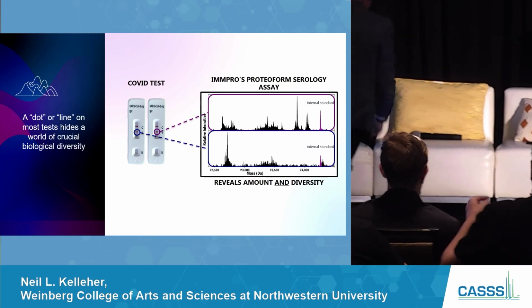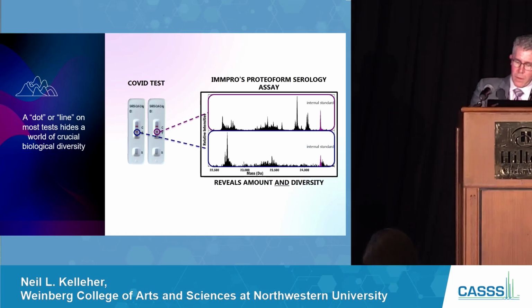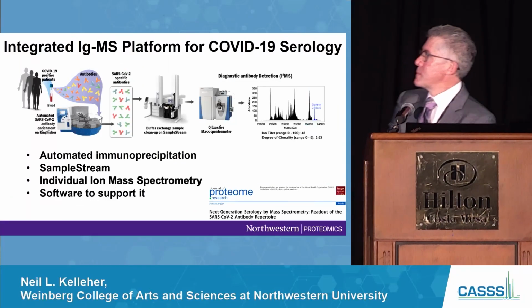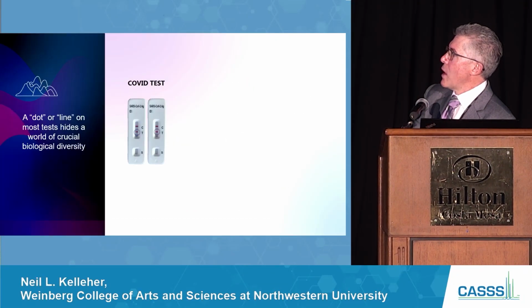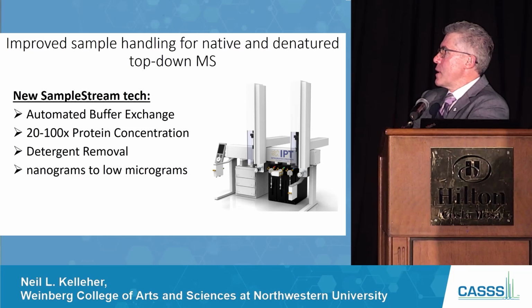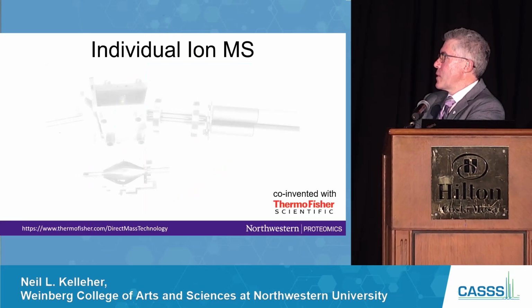In this case, you use the immunocapture, and obviously, since it's COVID, you would use something for a spike protein or something like that. But for the gut-brain axis, how would you choose your target? I missed his second question. So the pull down, where's the pull down? Yeah, it's a bit later.